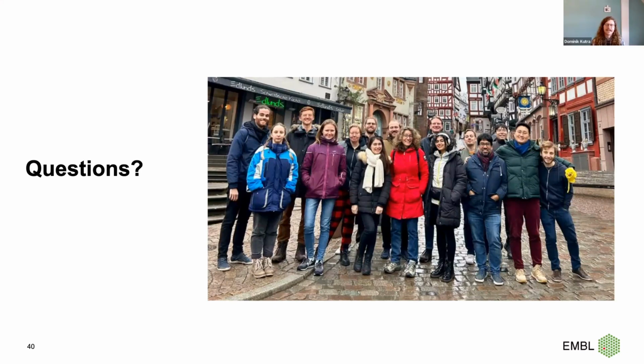I think this is hard to answer as a general question, because there is so much that goes into it. It's not only how different the domains of the two images are. It's also how well the model was trained, because you can do quite a lot with augmentation routines. You slightly perturb your training data so it looks a little bit different. If you do it in a very intelligent way, you can generate a model that generalizes to some respect, but it's really hard to tell in advance.